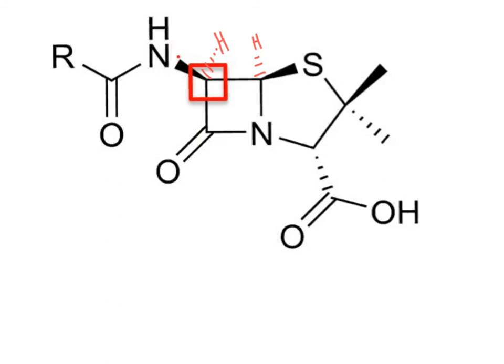We come up to here, and there's a heteroatom, so that's generally not going to enable correlations past that. So in this case, the proton that we have in red on the left in that box is going to have an expected COSY correlation to the proton that I've drawn the double-headed arrow to. And we don't really see any other expected COSY correlations for this.